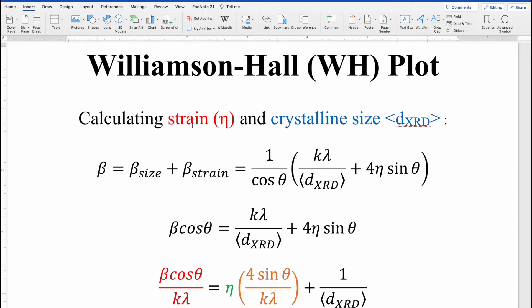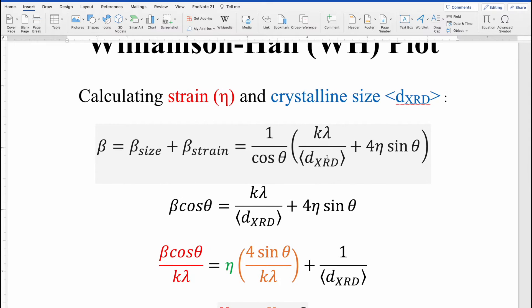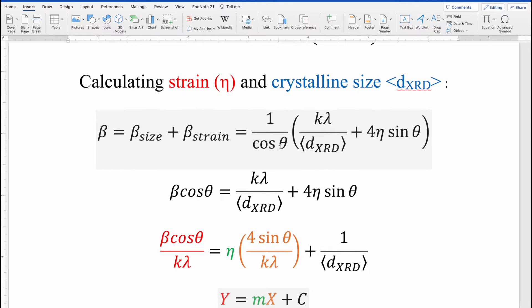In this video I will show you how to calculate strain and crystalline size from an XRD diffractogram using the Williamson-Hall plot. The Williamson-Hall plot equation is defined as beta, the full width at half maxima, equal to beta-size plus beta-strain. Beta-size is the Scherrer formula: K lambda divided by cos theta times D_XRD, and the strain term is 4 eta sin theta divided by cos theta, where eta is the strain and D_XRD is the crystalline size.